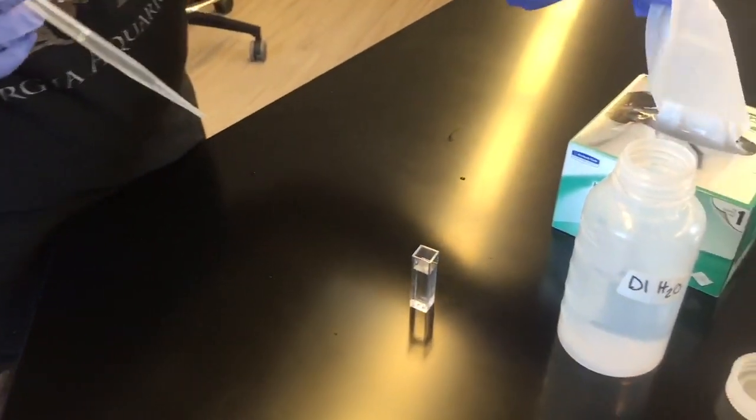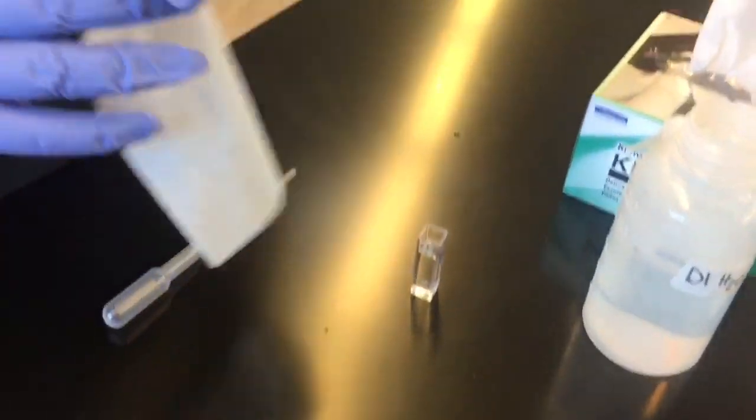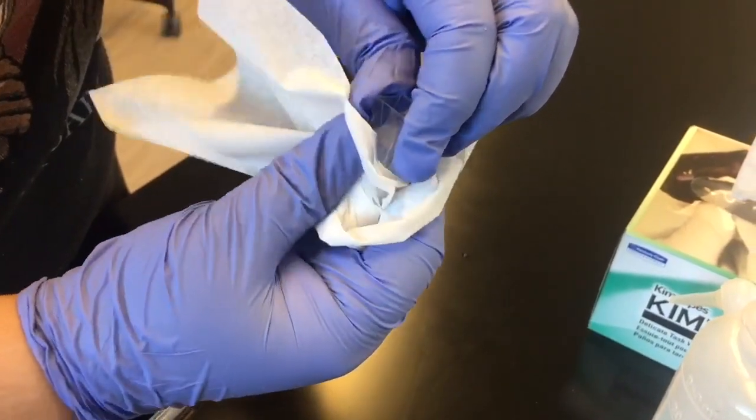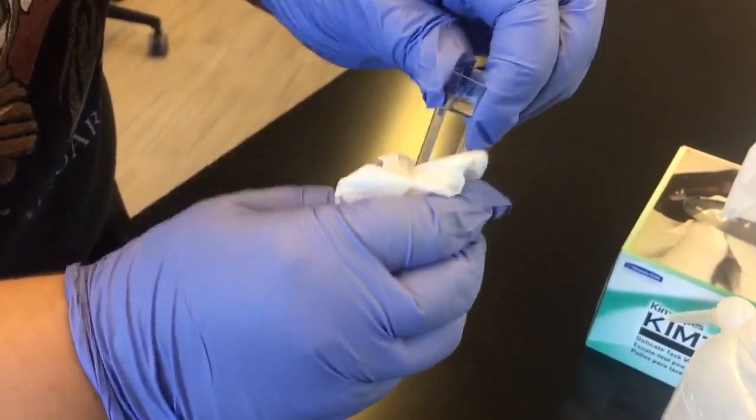What you're going to do next is take a Chemwipe and wipe all around the cuvette to make sure that you do not have any fingerprints or dirt of any kind.